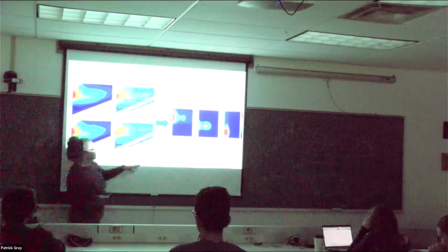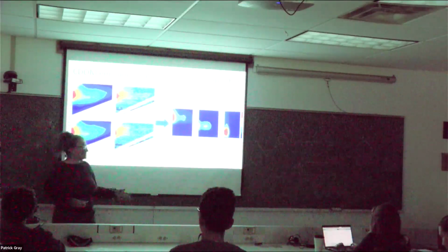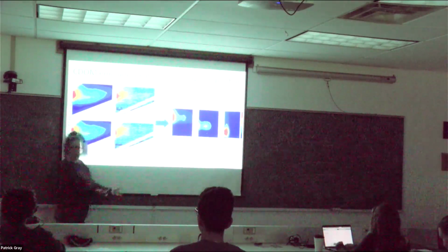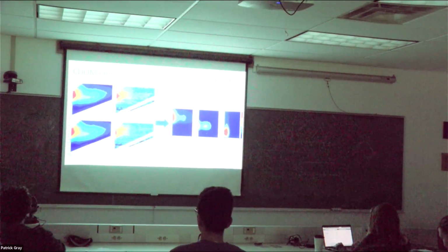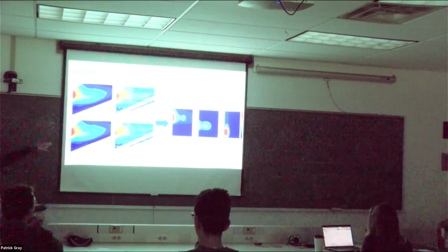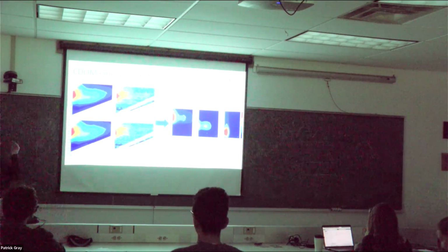Terrestrial is usually fresher, in a sense, and marine is probably more photo-oxidized. So it's changing its chemical components, and therefore its excitation and emission. You have chemical changes that are happening, and that's visible. These are really useful when you want to look at the photooxidation of your CDOM.